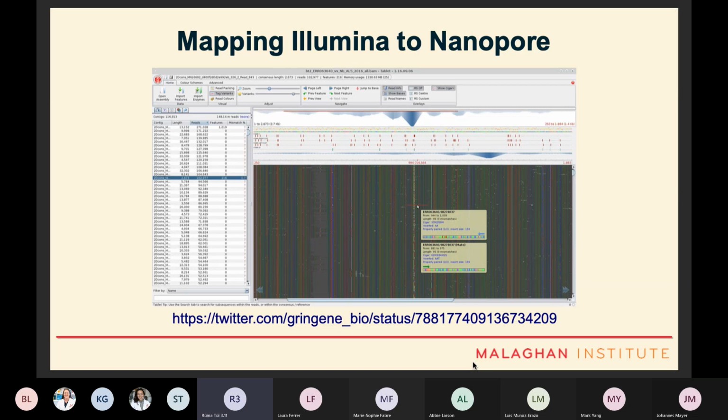What confused me the most when looking at this visualization is that I was expecting the Illumina sequences to hit my nanopore sequences pretty much randomly, which would produce a fairly uniform and flat profile. But what I got instead was a weird inverted mountainous profile, which you can see in blue at the top here. I actually spent and wasted a lot of time trying to write and use different programs to get rid of these things that I saw as visual eyesores.